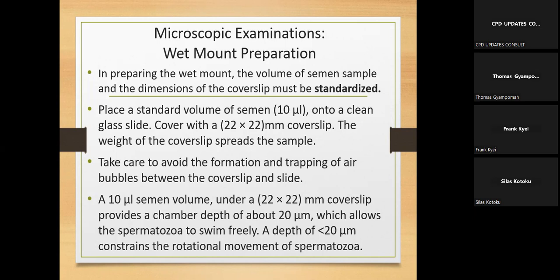The variety is useful for histopathology because they take sections, and some of the sections are very long. So you cannot use two different cover slips on the same slide. That's why we have that type, which can even be 22 by 50.